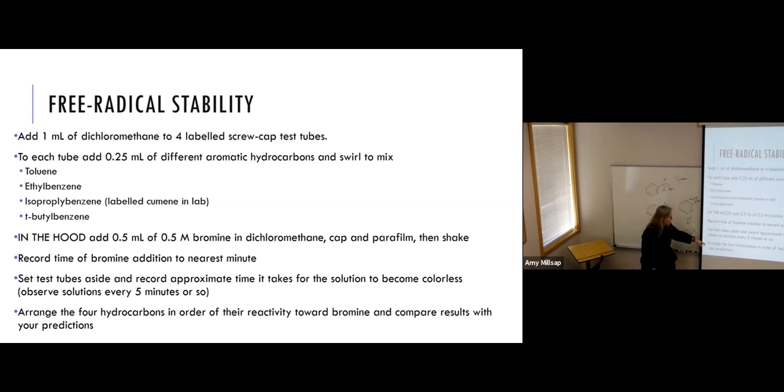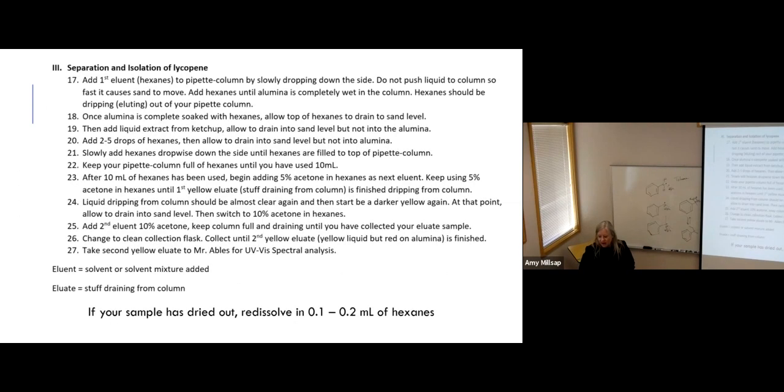And then arrange the 4 hydrocarbons in order of reactivity and compare your results with your predictions. Of course, I made the predictions for you. Then you should be working on your Lycopene Lab. This will by far take the most time today.